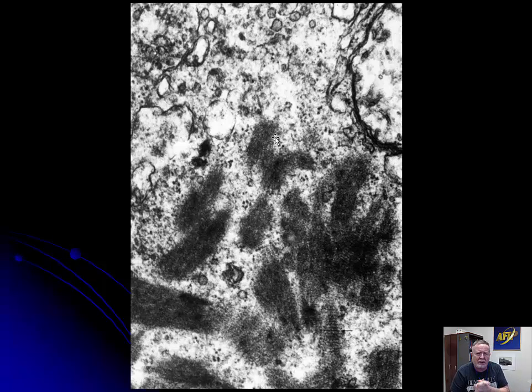And this is fibrin. And you can imagine why you would want all of your fibrin strands to go in one way, because stuff would leak in between. So it's put down on top of each other. So this is what fibrin looks like. And we'll have a couple of slides later on of various conditions where you have leakage of fibrin. And you can see it tends to be very dark. And it's not that difficult to recognize that, especially if you have erythrocytes in the neighborhood and maybe some white blood cells. This might be a little difficult because we have nothing else to say, this is fibrin. But that's what fibrin will look like.